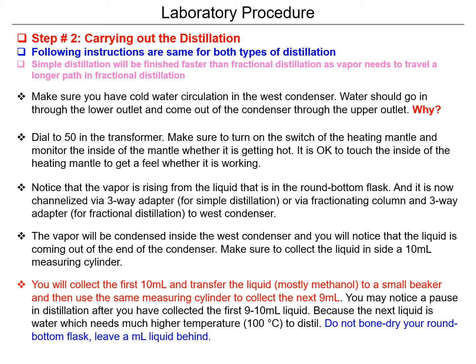After checking the connections, confirm that the vapors are going all the way through the three-way adapter and entering the condenser, forming droplets inside it. Also remember that when assembling, sometimes we forget to place the measuring cylinder right below the mouth of the condenser. If you forget to do that, the liquid will be spilled onto the table rather than collected in the measuring cylinder.